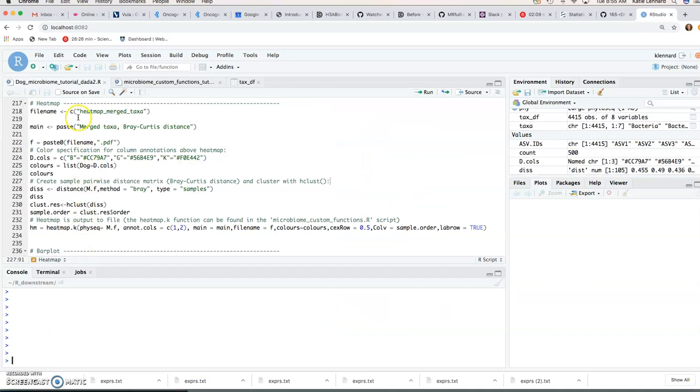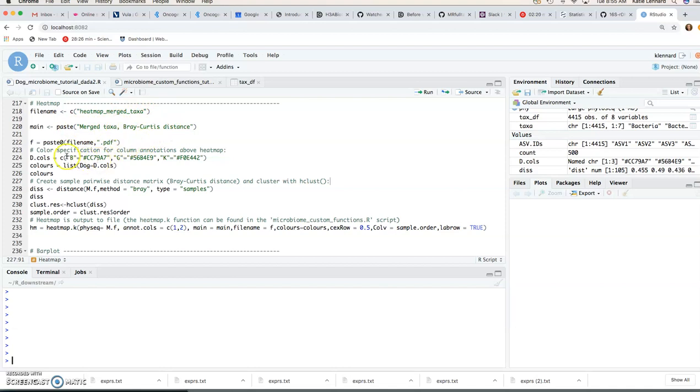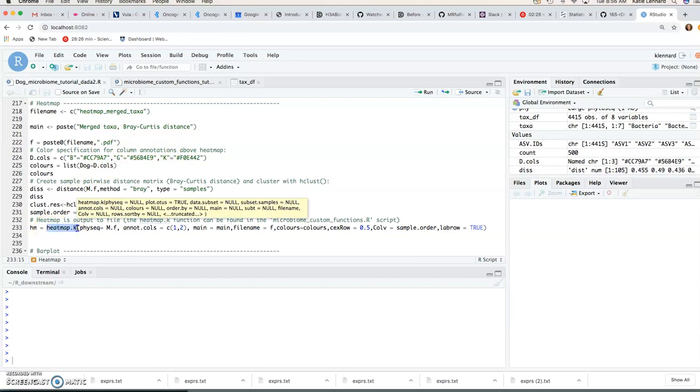Okay so let's try and make our own heat map with the dog microbiome data. The first thing we're going to do is we're going to specify the file name, the title for our plot and the color specifications for our column annotations. So this heatmap.k function is the one that we're going to be using and you can find that in this microbiome custom function script.